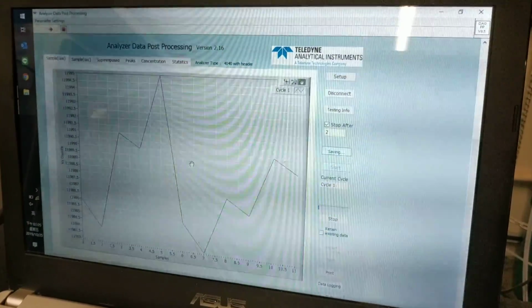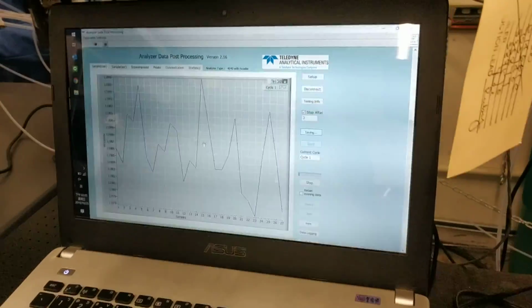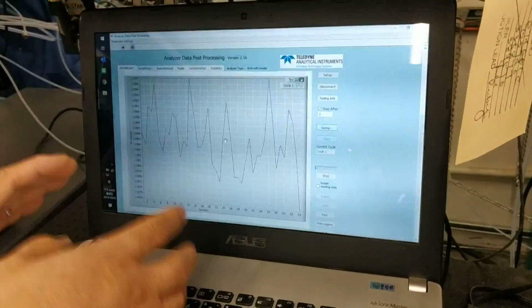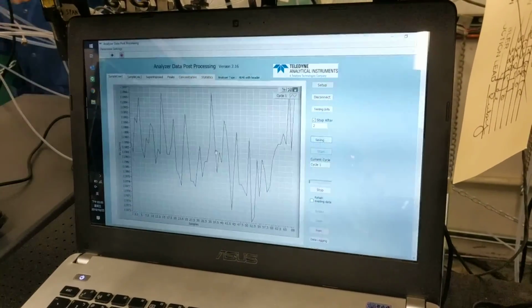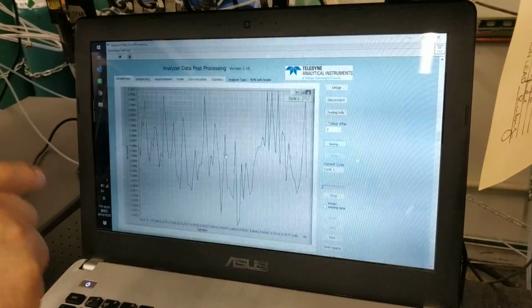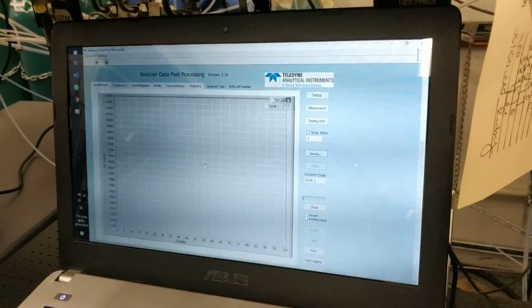The curve is dancing again. You can go away, and soon, in 2 cycles of time, it will show you testing completed. The data will be saved, and you can retrieve the data by the file name. And you forward the raw data in Excel format to us, together with the setting file in .cfg, and we'll be able to help you.